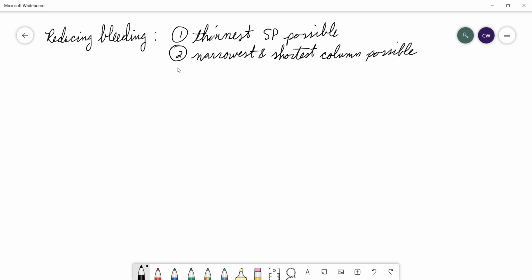The other thing we can do, all right, is we minimize oxygen in the column. Now, if we were at the university and able to physically go inspect the GCMS, I would show you that on the helium intake tank for the GC portion of the instrument, there is a filter that the helium gas passes over.